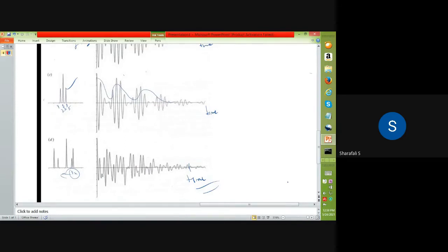If you have three different spectra and you convert them using the Fourier transform, you get a different signal in the time domain as compared to five different spectral spikes or spectral lines in your frequency domain that is converted to the time domain.